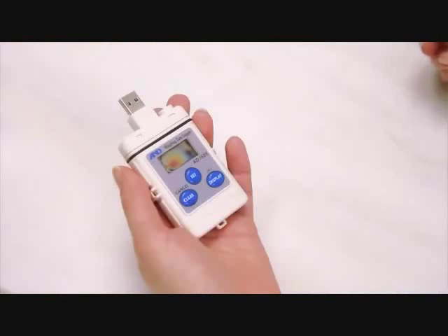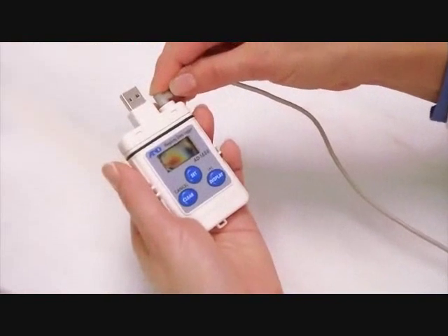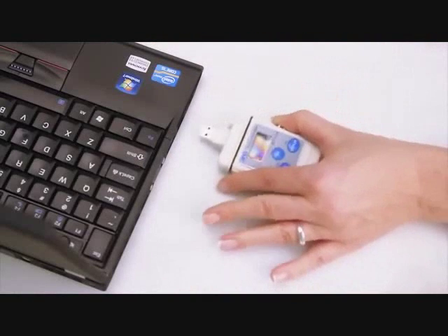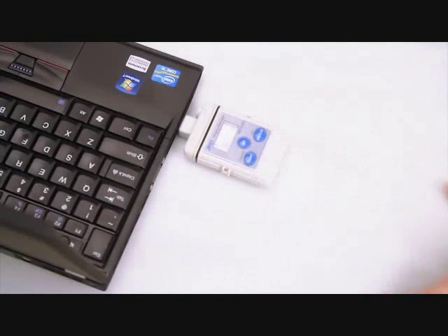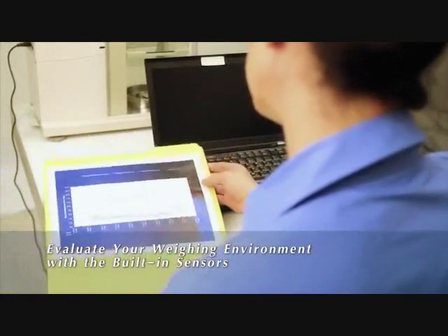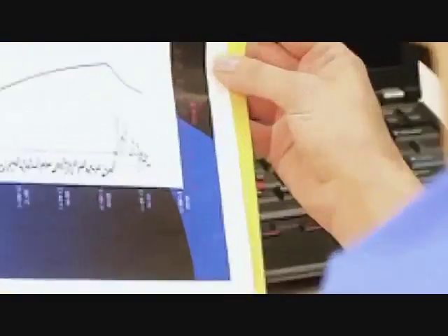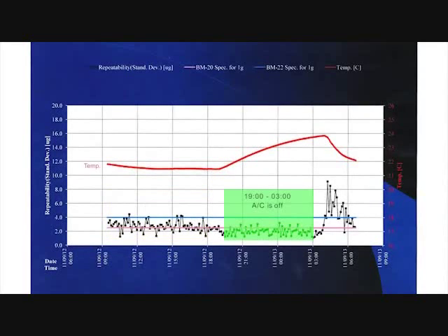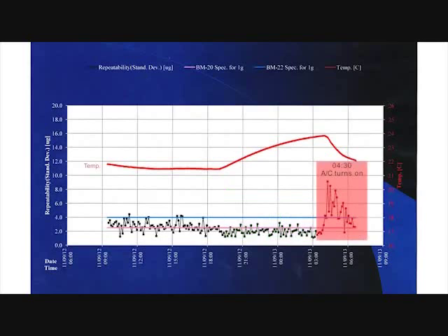The AD1688 data logger, included with all ION series balances, records weighing results together with environmental readings from built-in sensors. You can do this over a 24-hour period without the need for a PC. Here, we see how values vary over the day, indicating such effects as people movement and air conditioning. The influences acting on the balance are plain to see.